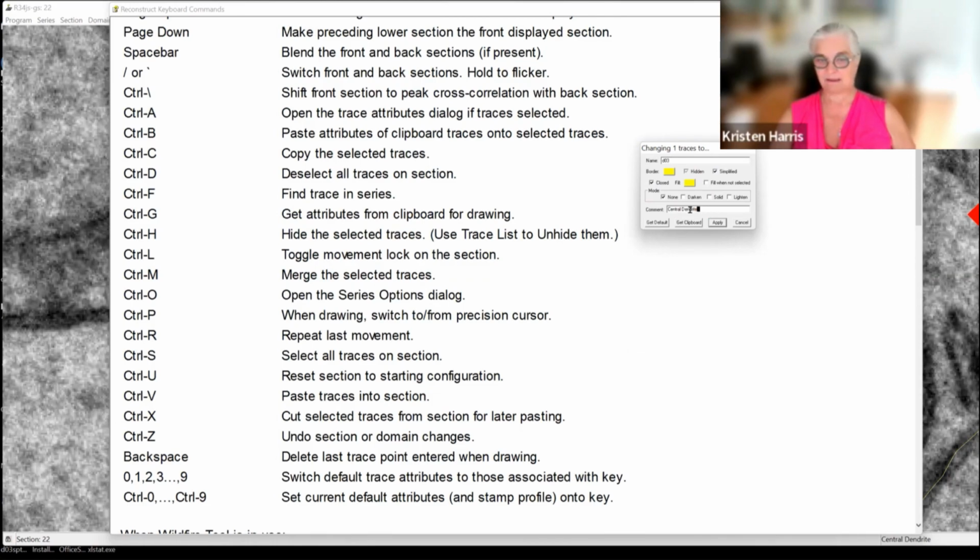And the comment, usually, so Edwin and I have talked about this a long time ago too, it'd be very nice that every trace receive a stamp that indicates the date, time, and username who created that trace, with a list of who modified it as well. Right now, I just force people to write that into the comment.